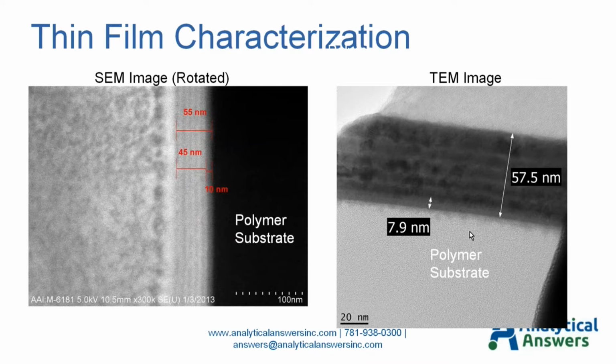One thing to point out, again, coming back to the fact that this is a 2D projection of a 3D volume, is that unlike our gate oxide case where we had sharp interfaces on either side, we have some surface roughness in this case, particularly as we move up the stack. And what happens there then is you can think of the individual roughnesses within the planes all superimposing on one another, and that tends to smear out the interface in this projected image.